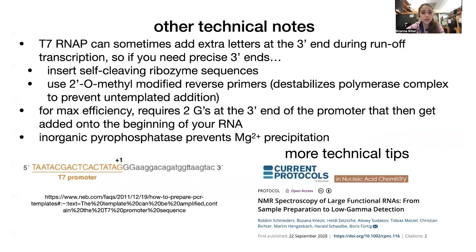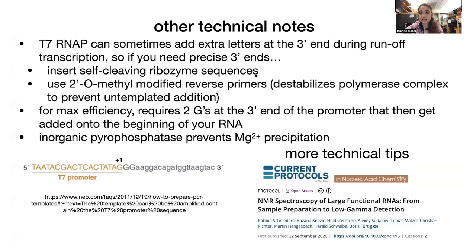Some final technical notes. T7 can sometimes add extra untemplated nucleotides at the 3' end during runoff transcription — when you're using a linear template without a T7 terminator. If you need precise ends, you can insert self-cleaving ribozyme sequences, which cause the RNA to cut itself off at the end, giving a defined end. You can also use 2'-O-methyl modified reverse primers, which destabilize the polymerase complex and prevent untemplated addition — the polymerase reaches those modified nucleotides, gets destabilized, and falls off before adding random letters.